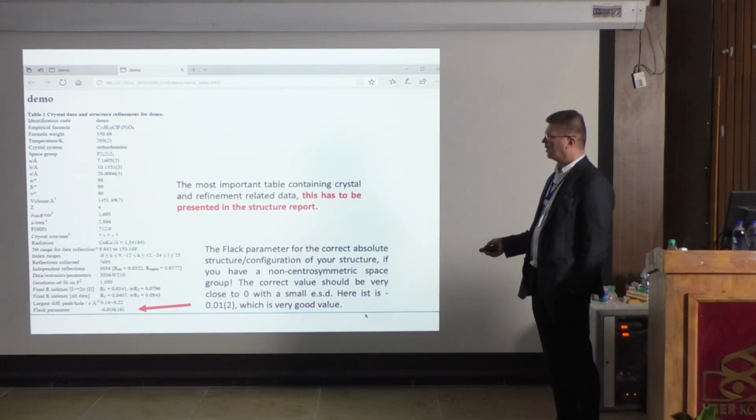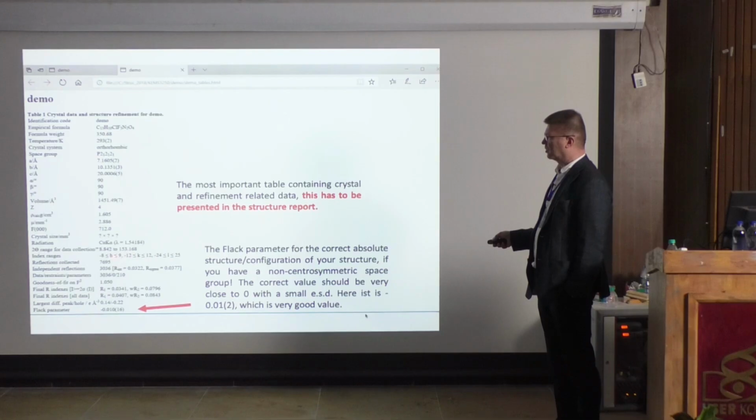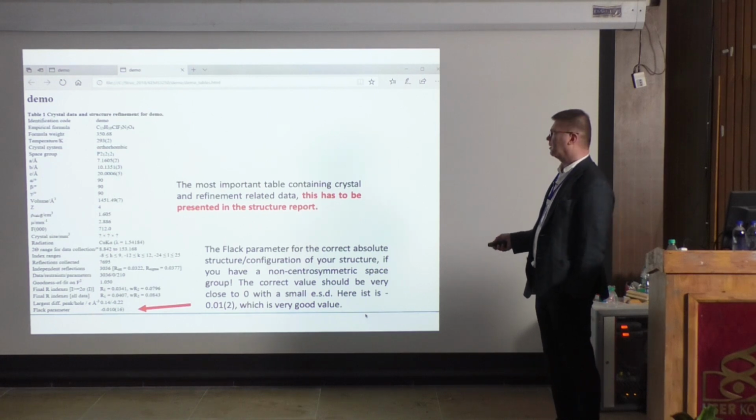And now if you look, there is a nice rule of thumb here. Because H relates to the A-axis. And the A-axis is 7, but now here the H range is bigger, it's minus 8 to 9. So it means that our resolution is then more than the length of this, so it's more than 1. And then if you look for the B, it's 10, and here we go 12 to 12.